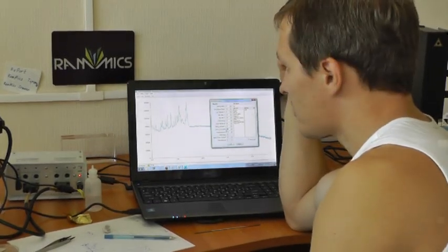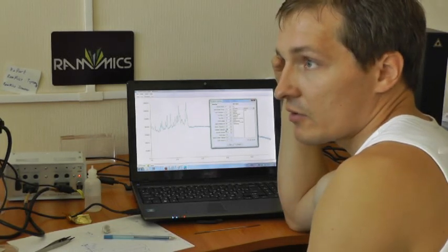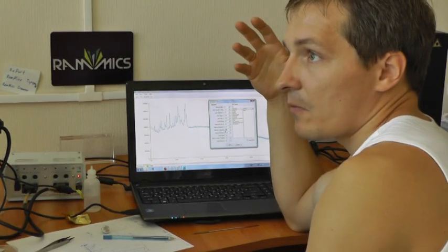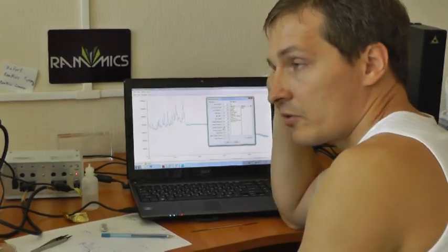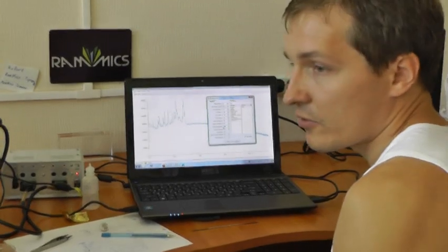But unknown spectra can be all the same or can be different. Imagine you have some medicine with 3 known components and some impurities, but you don't know what kind of impurities, and possibly the database doesn't have these spectra.